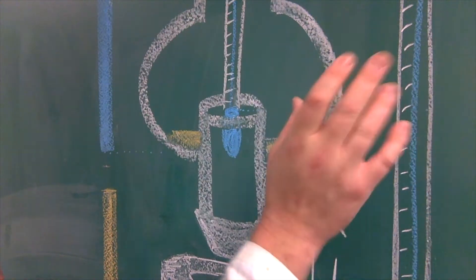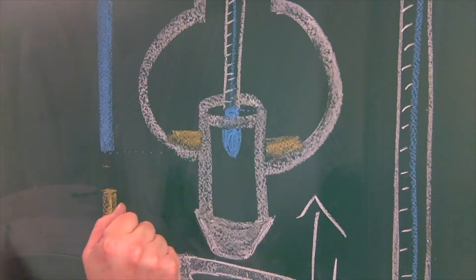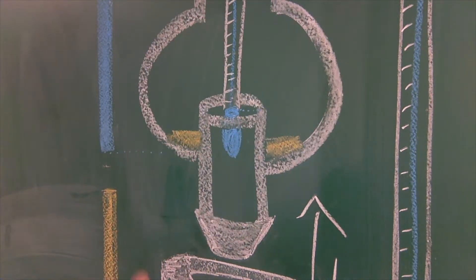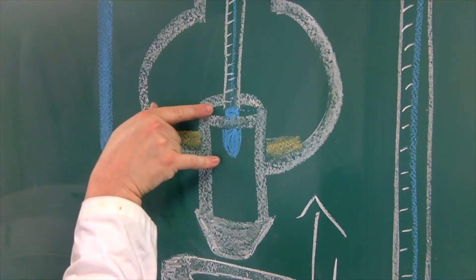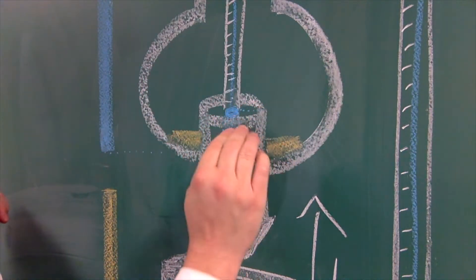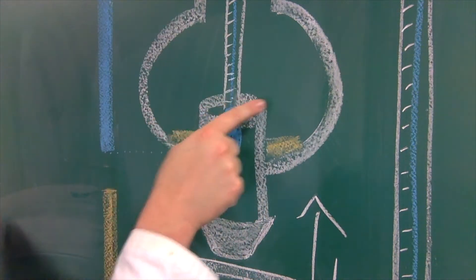We have two thermometers. One goes here for the sand bath so you can monitor the temperature the vial experiences — you want that to be hotter than the boiling point of your compound. The second one goes inside the Hickman to measure the boiling point as the compound comes off. This isn't strictly required for a distillation, but it is informative, and today we do want to find out what it is. Make sure the bulb of that thermometer is perfectly lined up with the edge of the circular lip, so the entire bulb is lower than the highest part of the inner glass — that way it condenses onto the bulb first for the most accurate temperature reading.